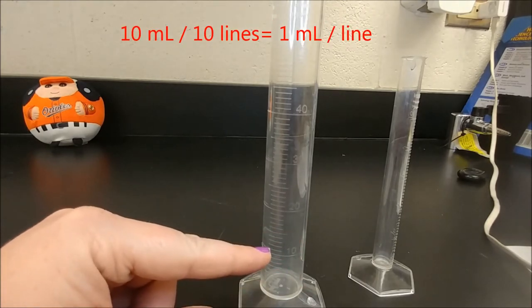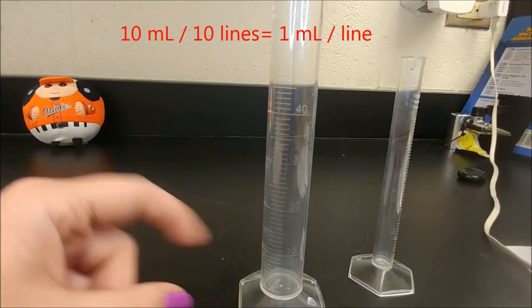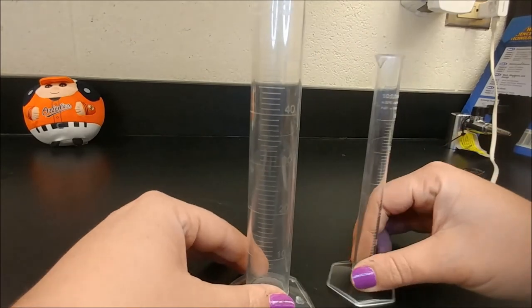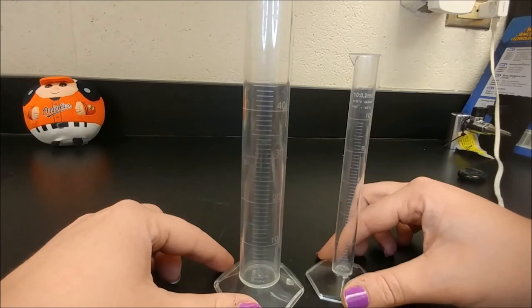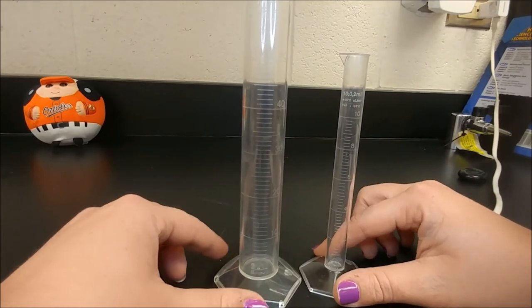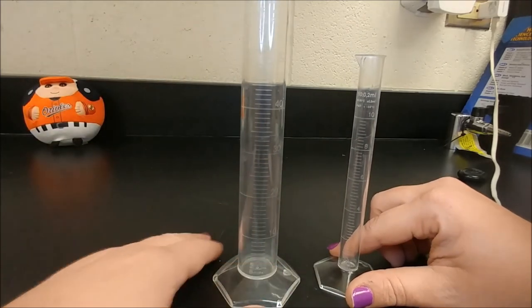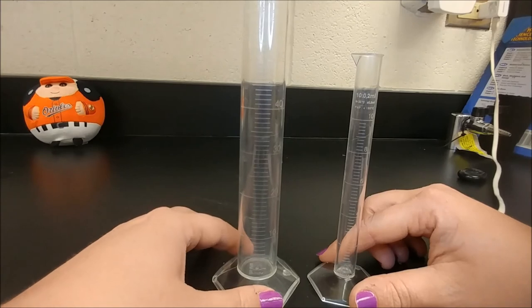So the line right above the 10 is 11, 12, 13, 14, 15 milliliters. Not every graduated cylinder is the same. You can see these two are both graduated cylinders because they have the same shape, but this one is significantly smaller. This one only goes up to 10, whereas this larger one goes up to 50. So this little one is actually even more accurate than the big one.